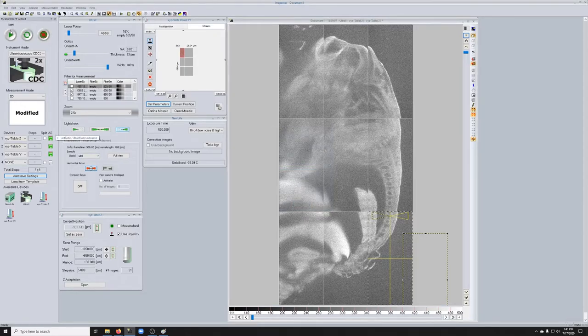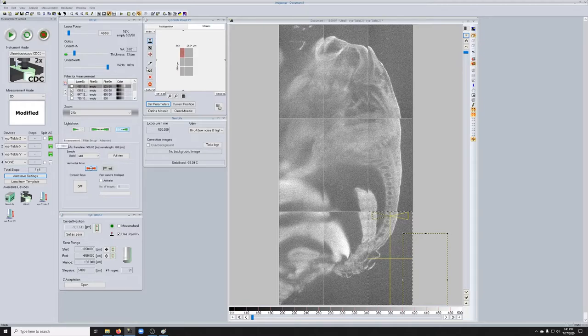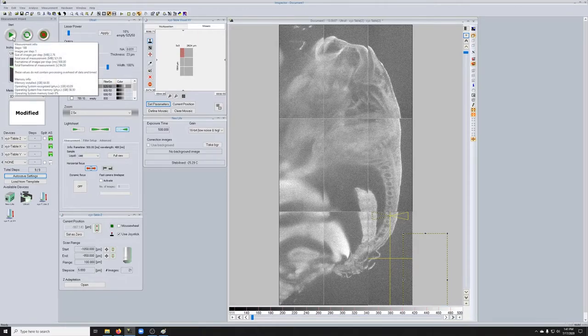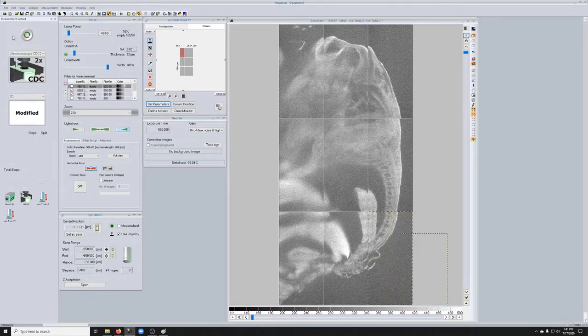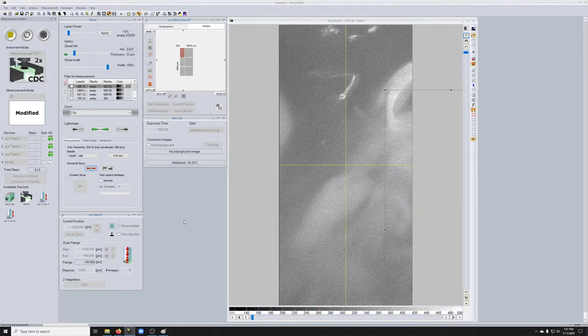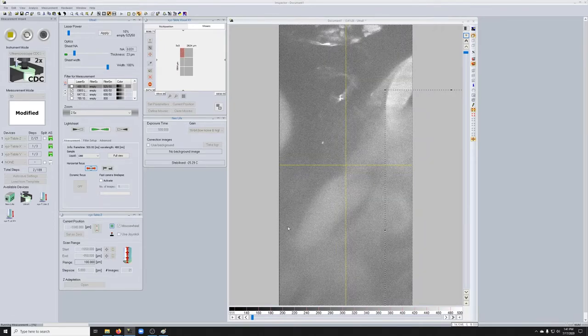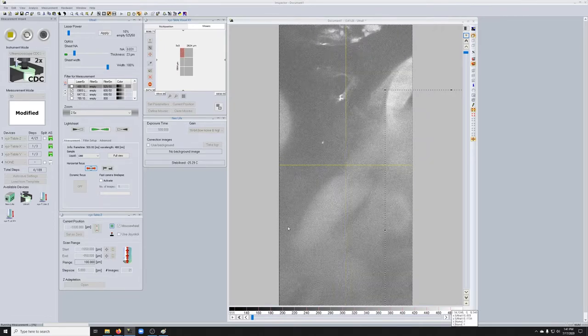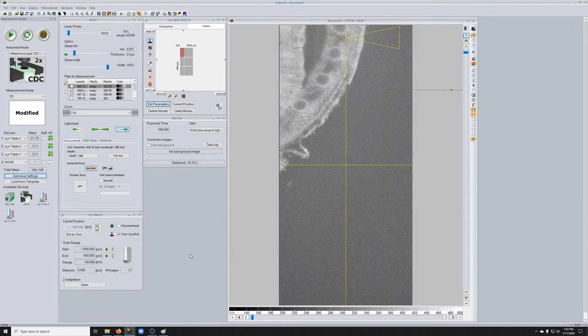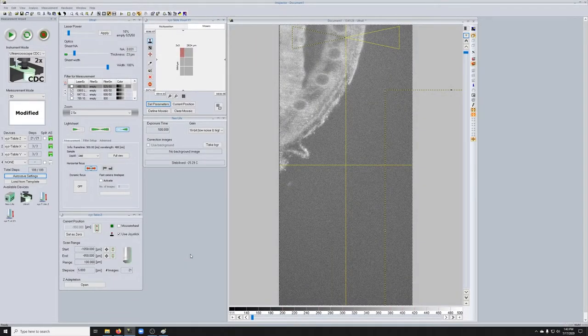And when I press start, it'll start imaging. So it'll go to the top left hand corner, take a Z stack of 21 images, move over, repeat until it's done with everything. So I'm going to start this and then I'll stop the video and I'll start it again once it's done. So you can see it's taking a Z stack there. Okay. So it's completed its imaging.